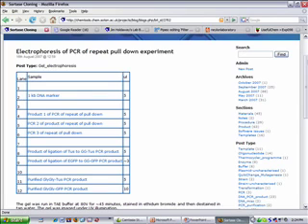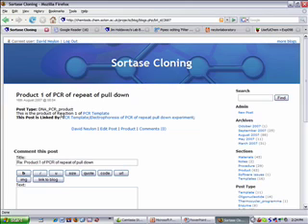So basically what I'm doing here is an analysis on a set of samples. This is a calibration standard that goes into that analysis, and these are my products that I'm doing analysis on. So where did these things come from? Well, if I click on that, this takes me back to a product post. So this is the post that refers to a material, a tube of something.